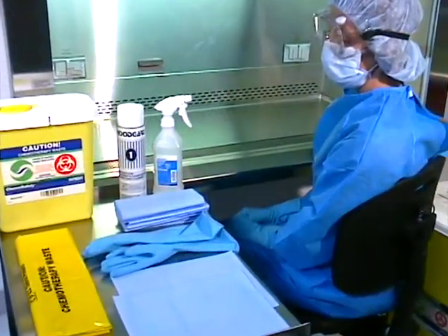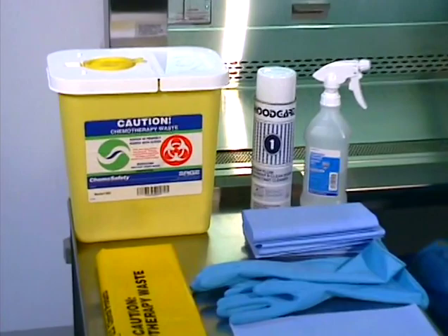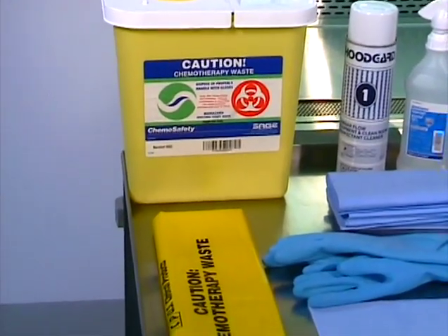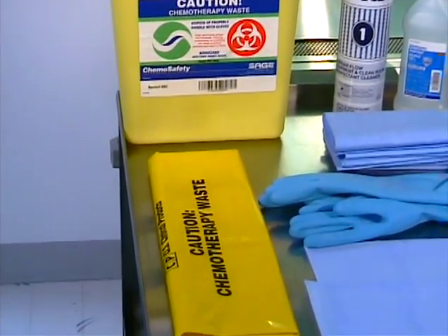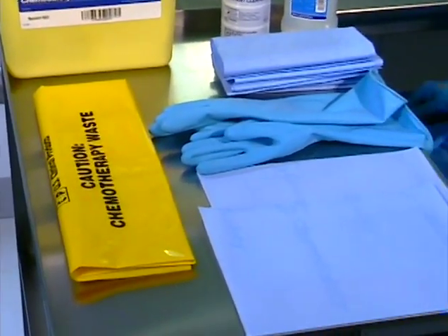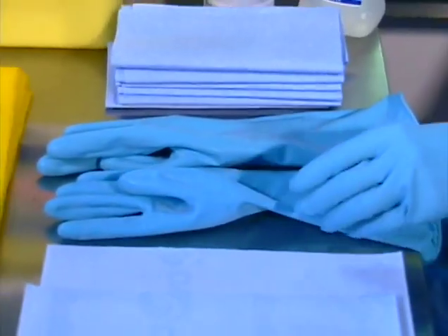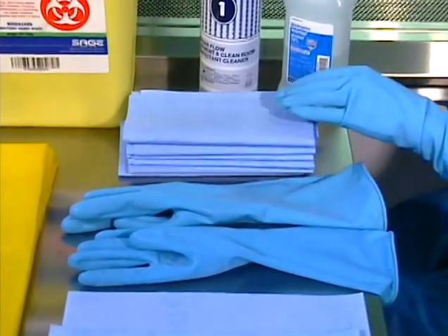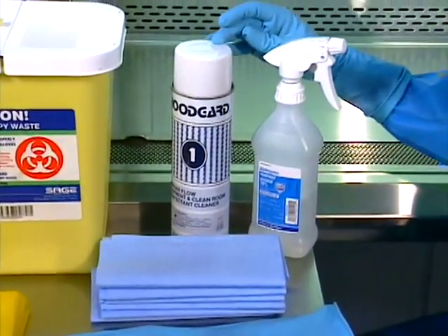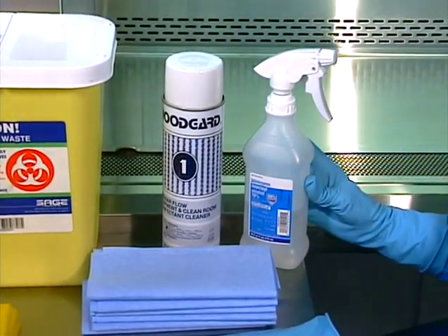Stage the cleaning materials close to your clean supply hand, including a sealable chemo waste container which will fit in the hood and is large enough to accommodate cleaning waste, a chemo disposal bag large enough to contain the waste container, 2 chemo-resistant mats, or 1 mat cut in half, 1 additional pair of outer gloves, at least 10 low-linting disposable wipes, a high pH low-residuing water-based cleaner, and 70% IPA for final disinfection.